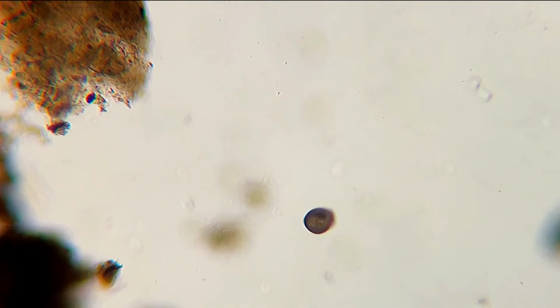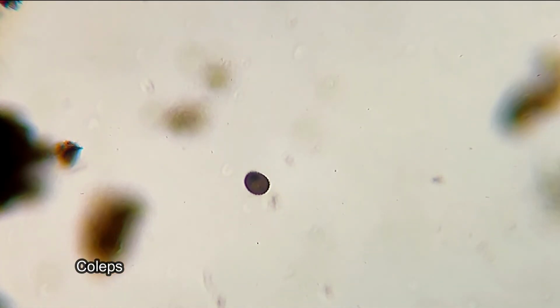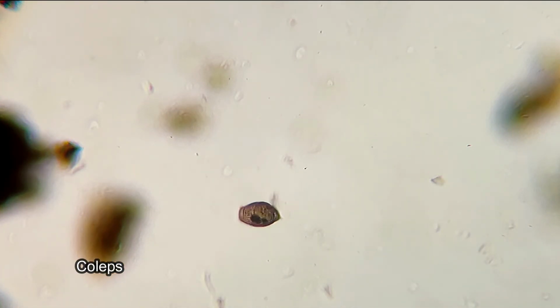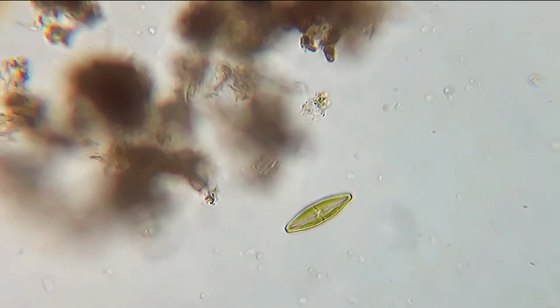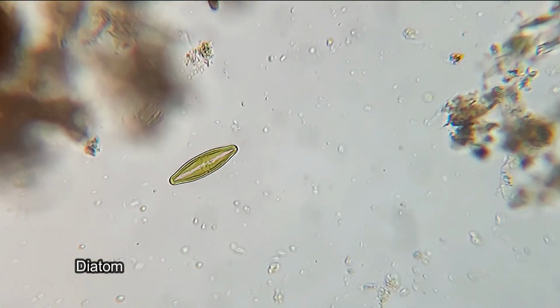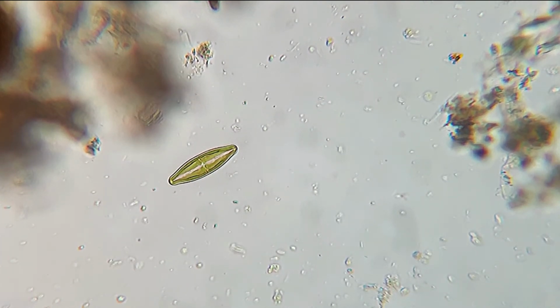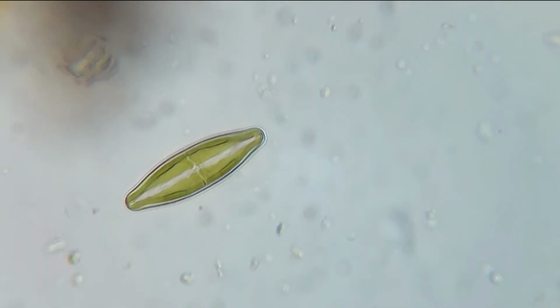This playful microorganism that we see is a ciliated protozoan called Coleps. Isn't it amazing how he swims? Look at this diatom. Diatoms are so incredibly pretty. Diatoms are microscopic algae, and the amazing thing about them is that they make glass cell walls with extraordinarily beautiful patterns.